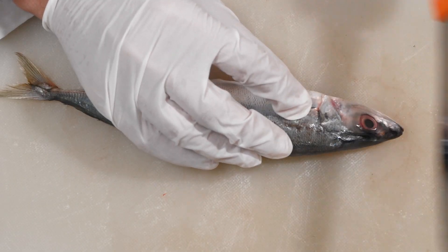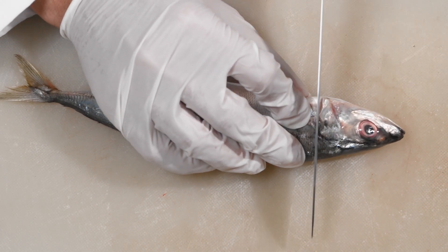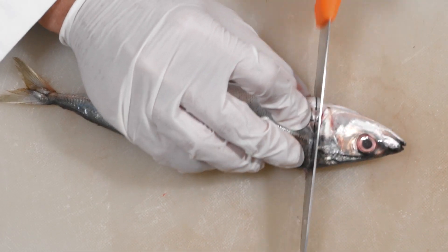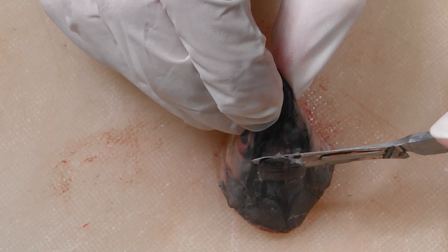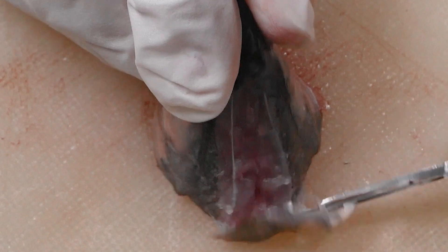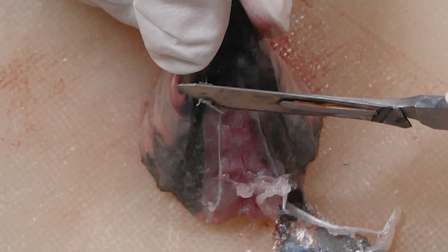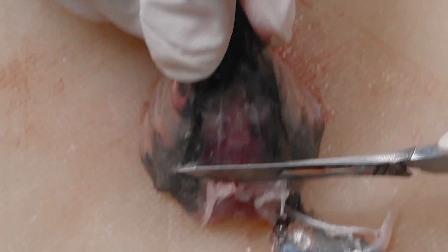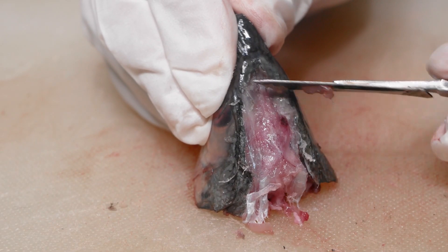First, cut off the head near the first vertebra. This will allow you to handle the head better, which is the focus of your dissection. Next, remove all the soft tissues surrounding the skull. These consist mostly of muscle tissues — remove as much tissue as you can. This will help expose the cranium of the fish.